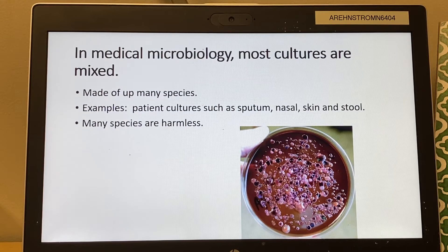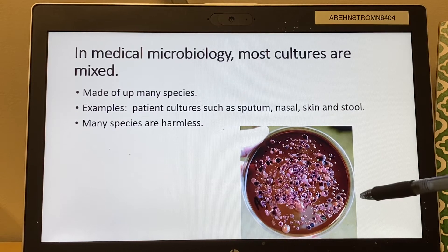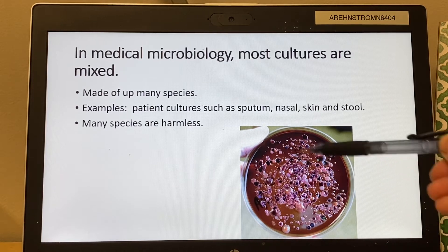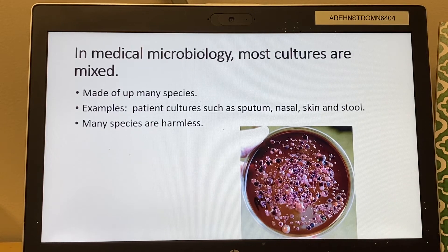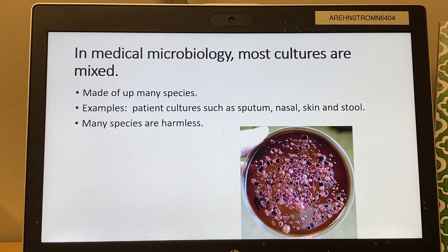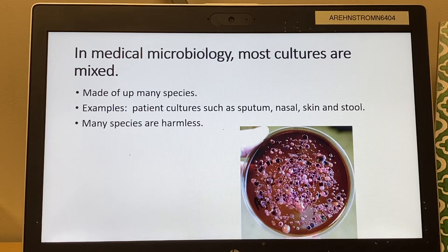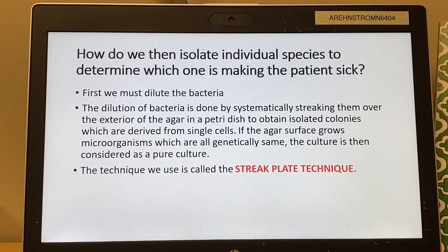You have to try to find the one bad guy causing the infection. Your original plate from a throat culture may look very concentrated, and you have to figure out which species is the bad guy. What we want to do first is take that mixture and dilute it so we can get individual colonies — because when it's too concentrated, we can see multiple species due to different colors and appearances, but they're too dense. We need to spread them out before doing future tests like the gram stain, acid fast stain, or biochemical tests.